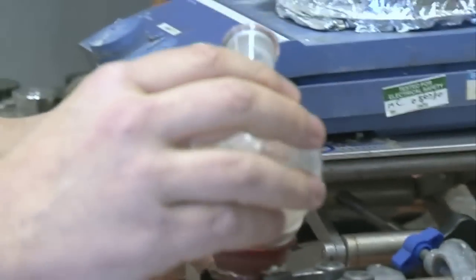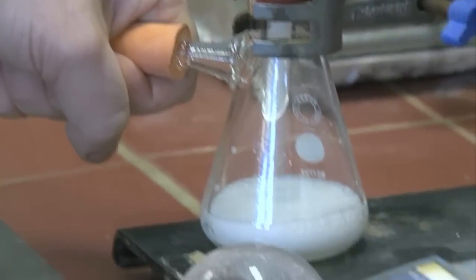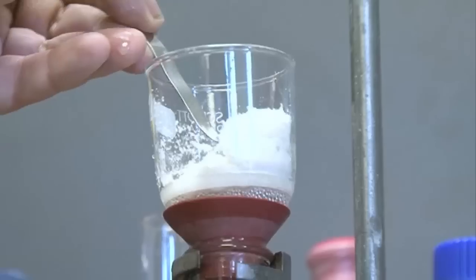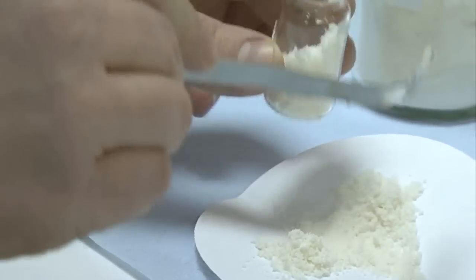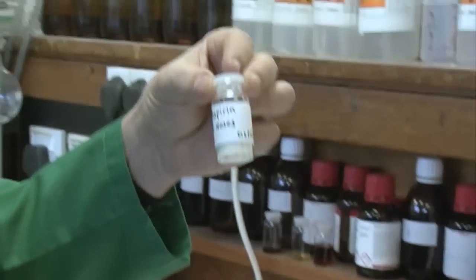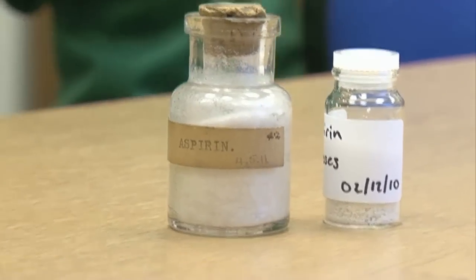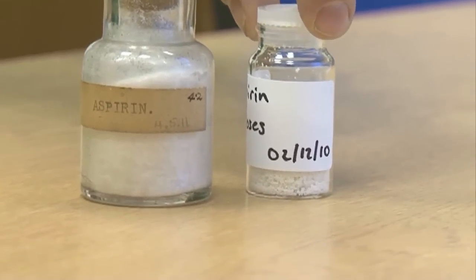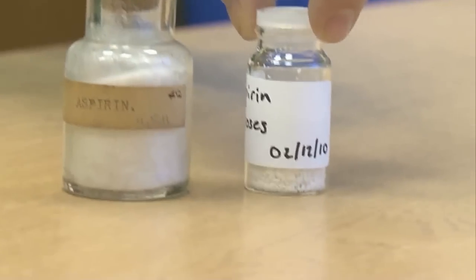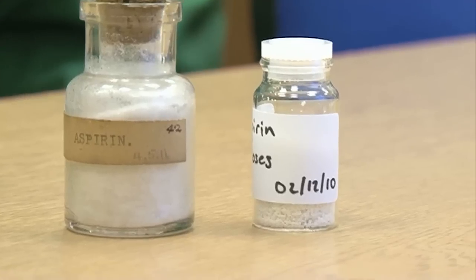Here it is. I'm going to swirl the flask and pour the contents into the filter funnel. You've got some aspirin — there's quite a lot of it. There's a bottle of aspirin. Here's the sample that Kipping's group made in 1911, and here's the sample I just made in the lab in 2010 — almost a hundred years between them. Kipping's sample looks a lot better than mine, despite being a lot older. There we have it, side by side.